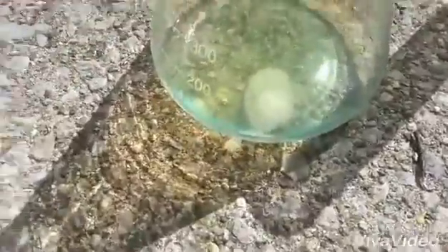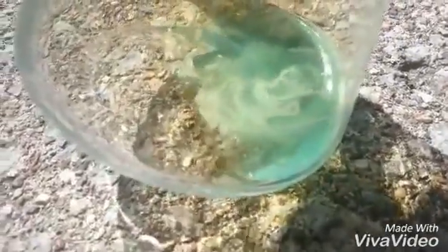As you can see, it's producing more nitrogen dioxide gas, but it is dissolving the copper away. So within the next hour or so, maybe less, I should have just gold in solution.